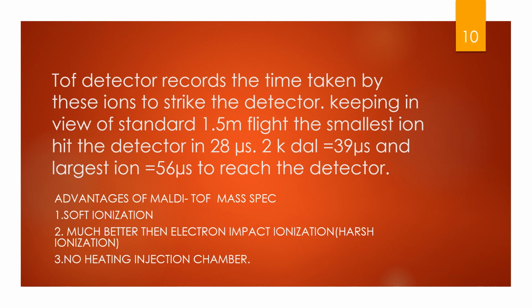Advantages of MALDI-TOF mass spec. Number 1, soft ionization. Number 2, much better than electron impact ionization, also called harsh ionization, as it fragments the molecules during the process. Number 3, no heated injection chamber is needed.